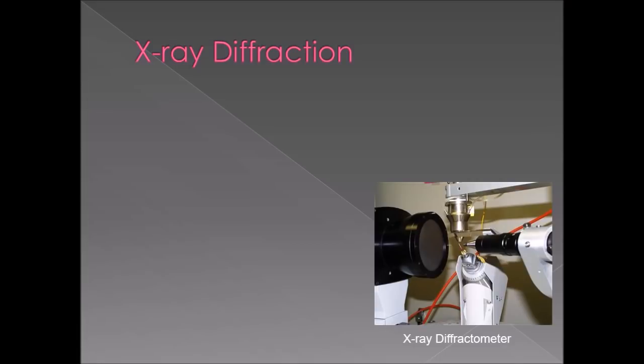So let's go into X-ray characterization. X-ray is a type of ray with a certain wavelength that's known. Say now you have a crystal structure like this, arranged in a 3D long range order.